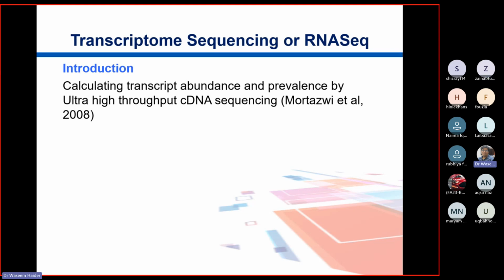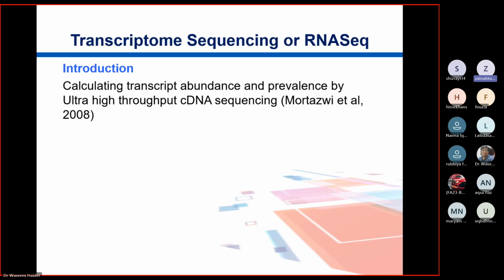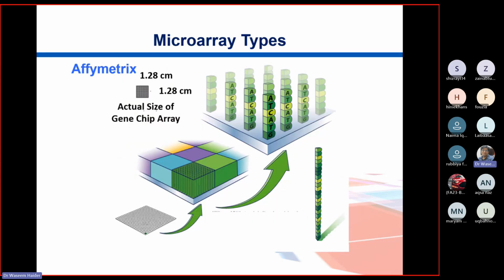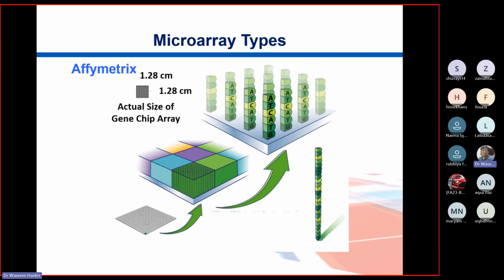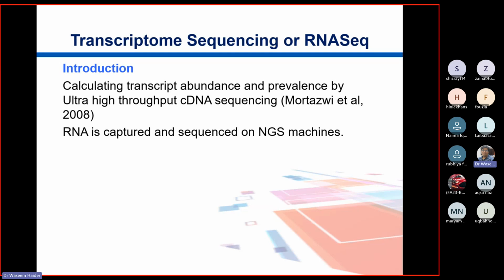Sir, we are using the single-stranded messenger RNA and then it is combining with the probe to form a cDNA, or we are using the cDNA? No, no, cDNA. Here we convert them to cDNA because RNA is not that stable, no? So these are fluorescently labeled cDNAs. So obviously it's DNA to DNA hybridization, because RNA is degradable, it cannot survive. And a similar thing happens in NGS.